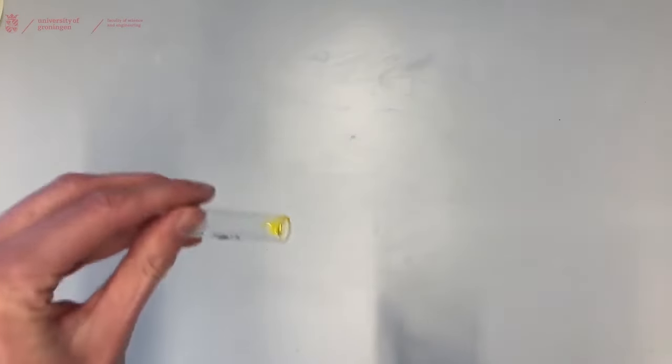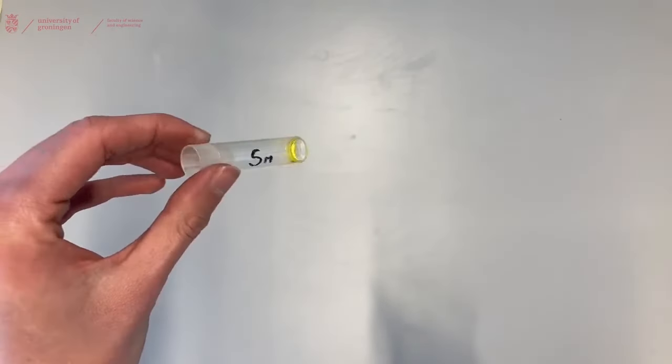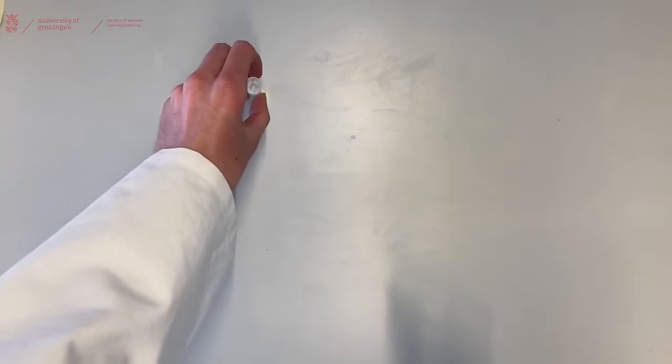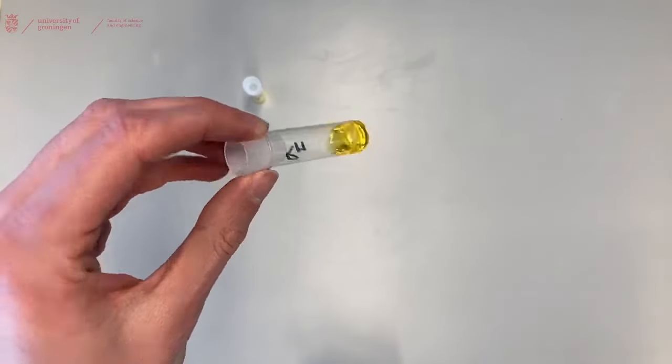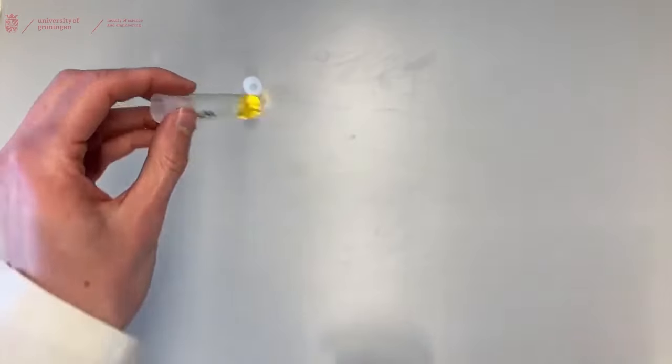In this video we will show you how to perform a TLC. For your TLC you will need pure starting material dissolved in solvent and your reaction mixture or a diluted reaction mixture.